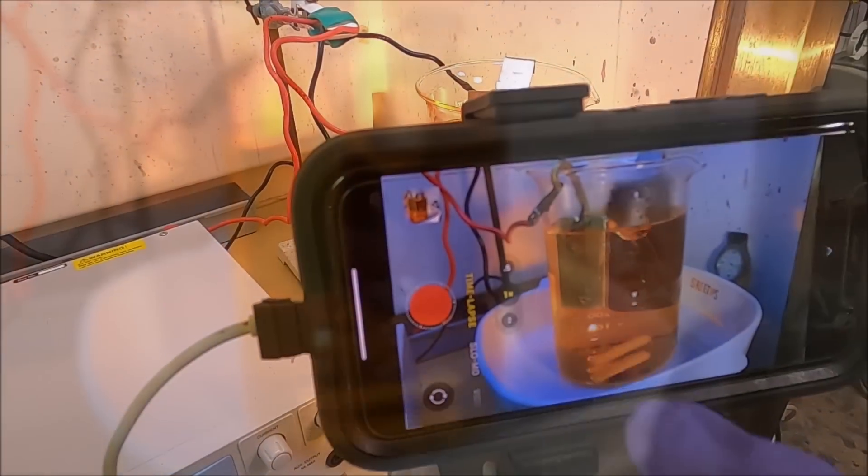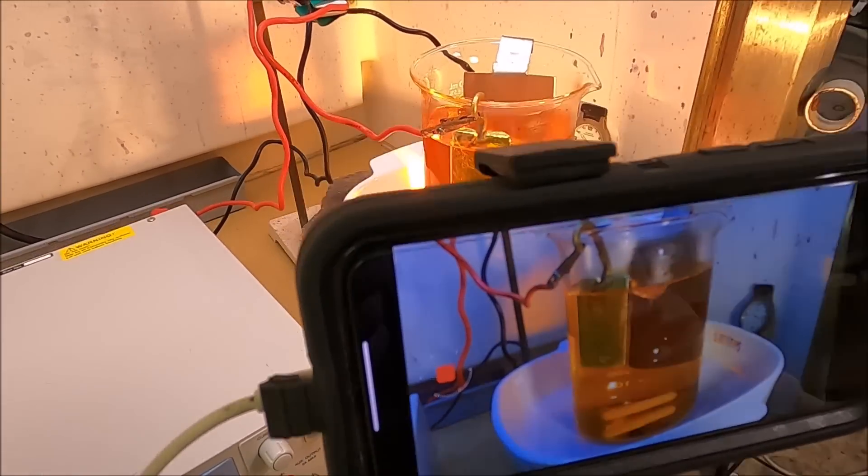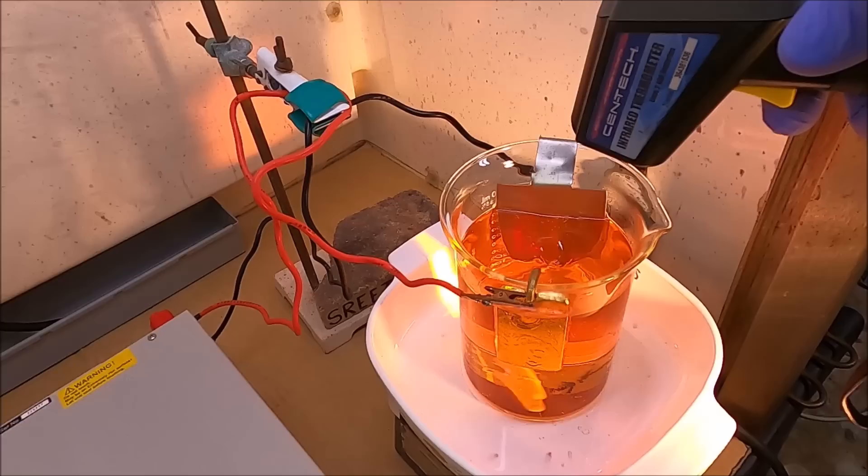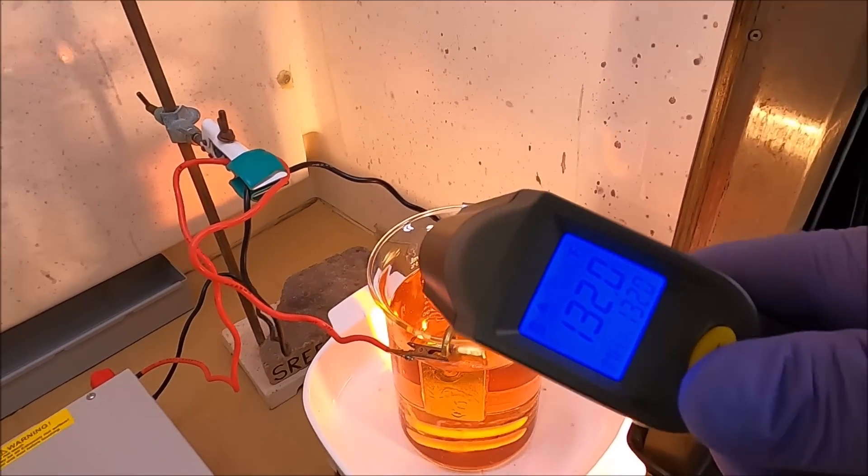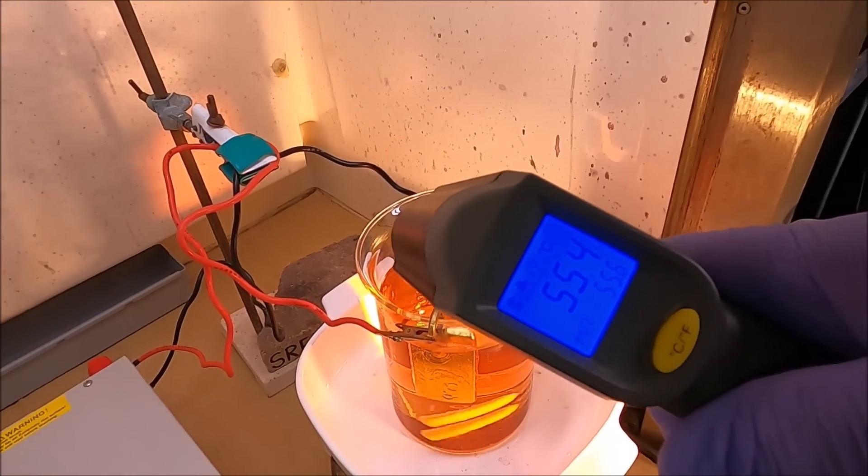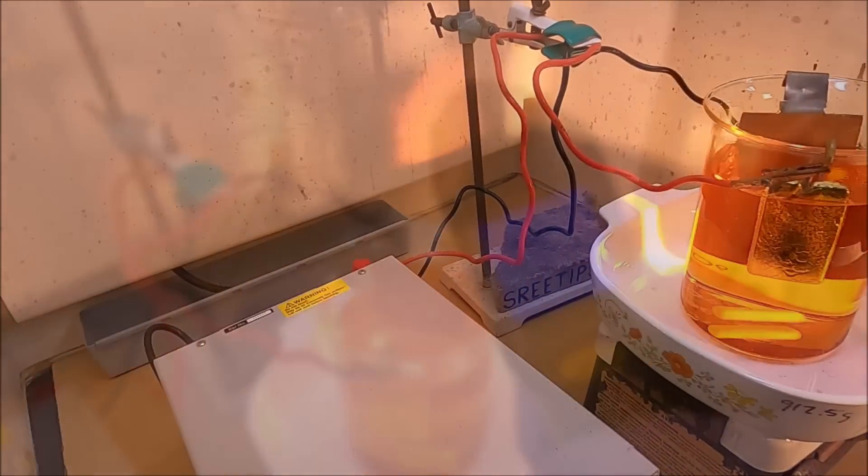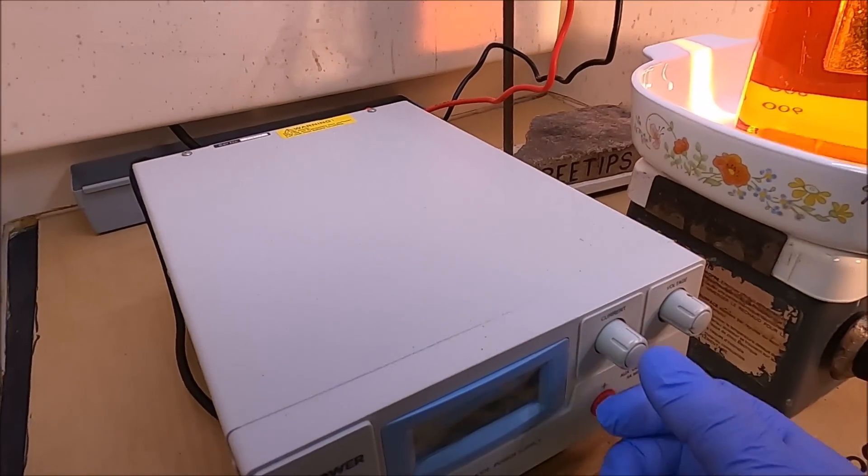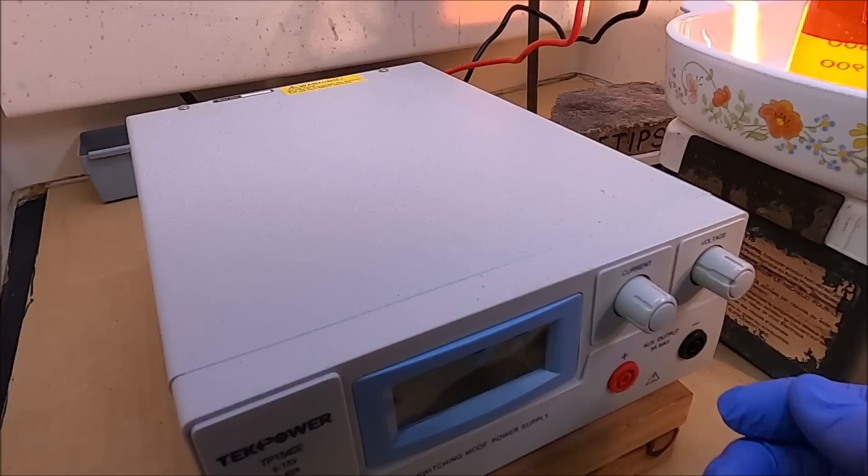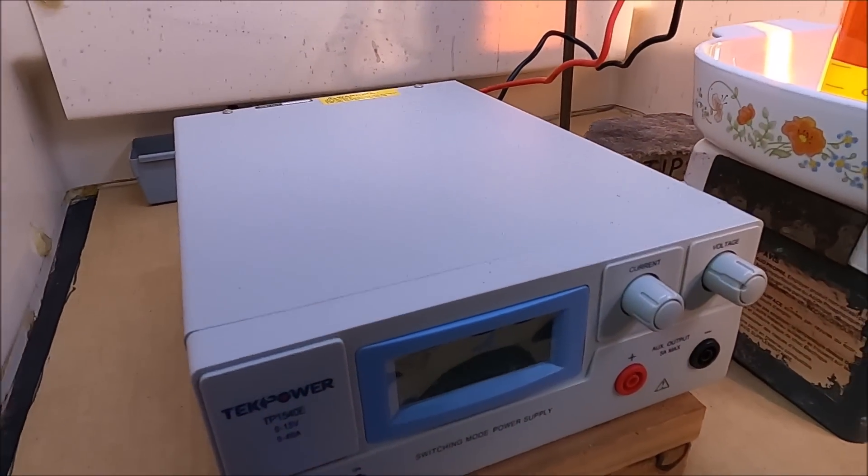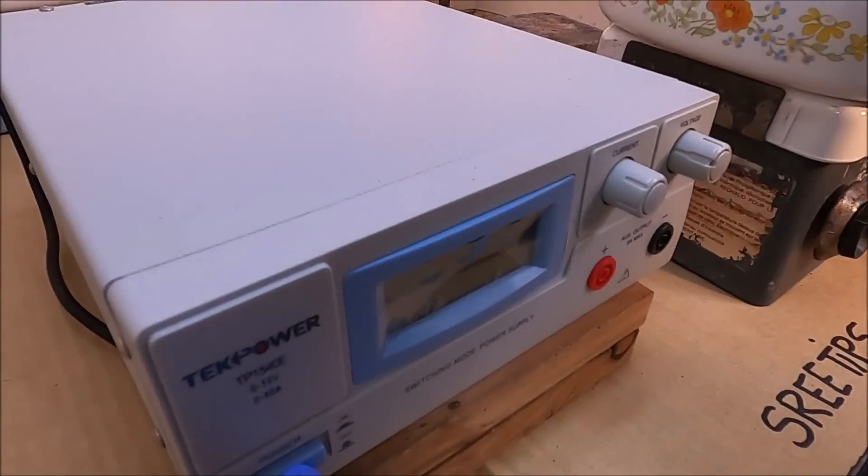I'm going to start the time lapse. We've got 132 Fahrenheit and 55.4 Celsius. What I'll do now is turn the current flow all the way up and the voltage all the way down. I'm going to energize the power supply now. We shouldn't get any kind of reaction when we do this.